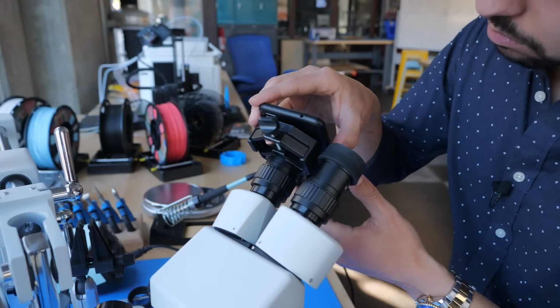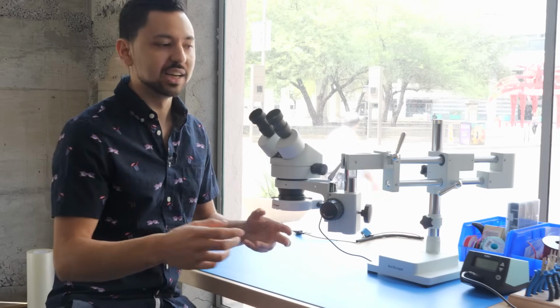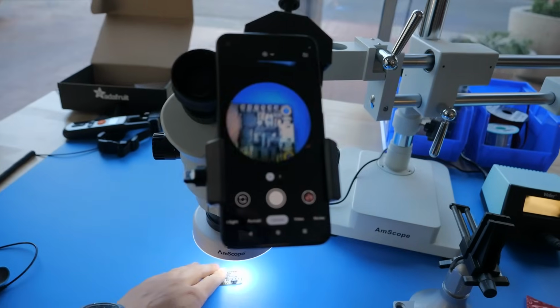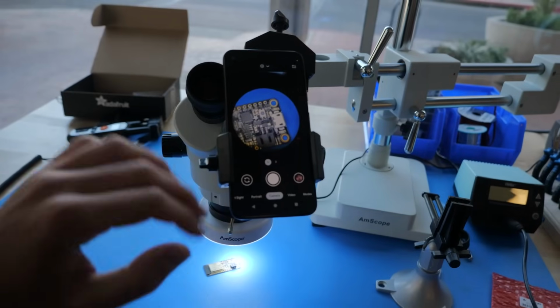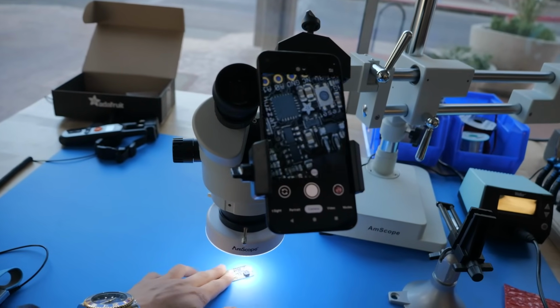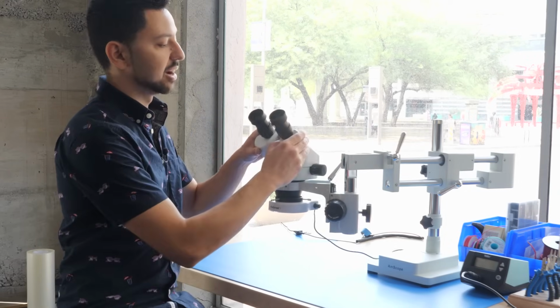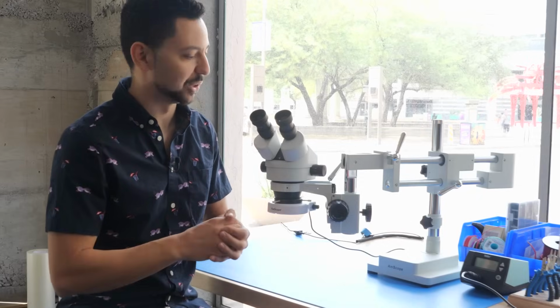The primary advantage of this microscope is that, number one, it's relatively low power or low magnification, which seems like a bad thing, but in reality, you need to match your magnification to what you're actually doing. And the flip side of that is that by having a lower magnification, you get this really long working distance, meaning that the focal plane of what is in focus under the microscope is relatively far away from the bottom of the objective itself. And so this gives you just a lot of practical room to be able to do manipulations. In addition to that, the depth of field of these lower magnification microscopes is typically a lot bigger. In addition to that, because you have two of these eyepieces here, you get stereoscopic vision, meaning that you actually have three-dimensional vision under a microscope, which is sort of a trip when you see it for the first time.